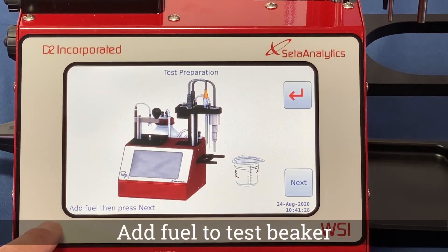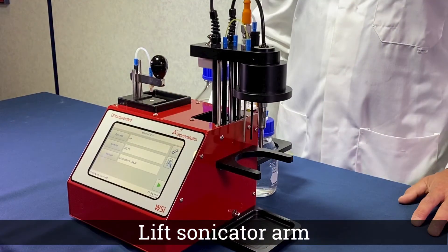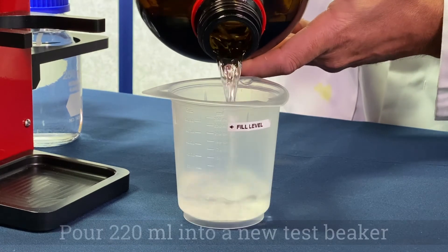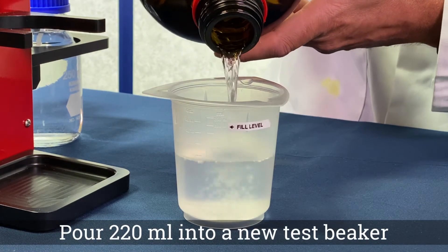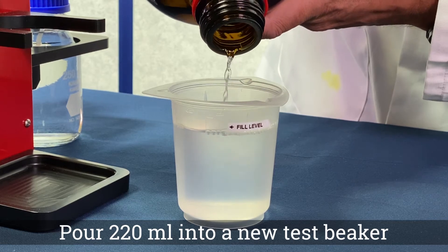Follow the on-screen instructions for the test preparations. Lift the sonicator arm by pressing and releasing the lock button. Prepare the sample as per the test method and pour 220 millilitres plus or minus 10 millilitres into a new test beaker.